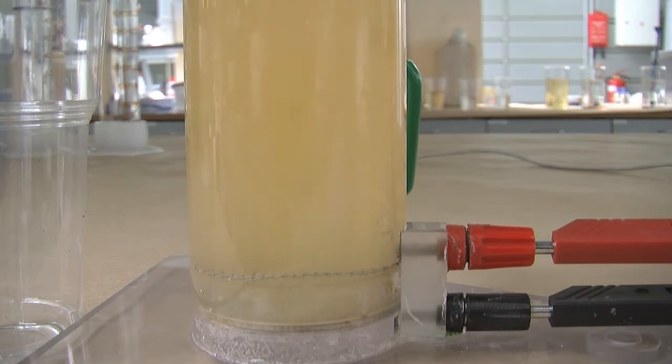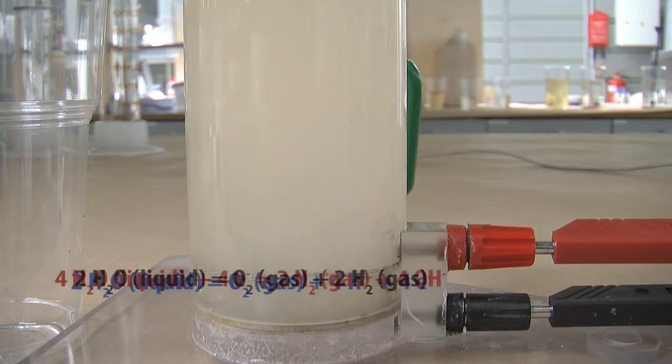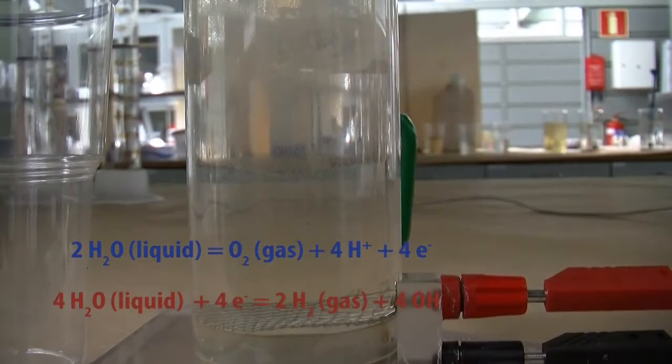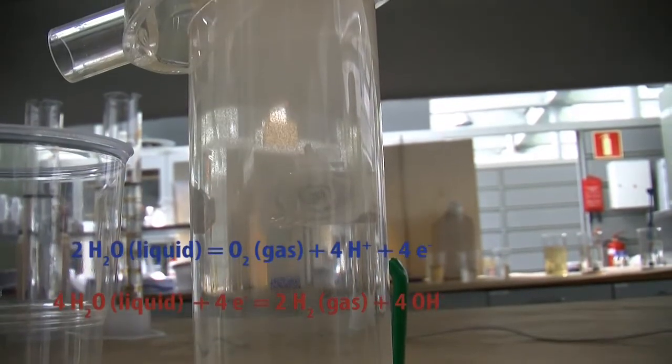The resulting floc-bearing foam is skimmed off the surface of the flotation cell, and clear water is decanted from a lower level of the cell. In the laboratory of the Vasa University of Applied Sciences, we have a laboratory-scale benchtop flotation cell. However, it is somewhat unconventional as it uses electrolytically produced hydrogen and oxygen as the flotation gases. Due to this electroflotation technology, the apparatus is small in size, highly portable, and convenient for even classroom demonstrations.